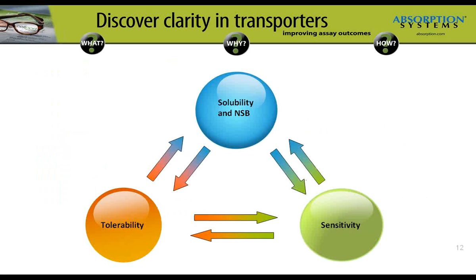And in conclusion, when you modify certain parameters of an in vitro transporter assay, it's imperative that you take others into consideration. All of these are interrelated. For example, when you enhance solubility or alleviate nonspecific binding, you must be cognizant of tolerability and assay sensitivity.